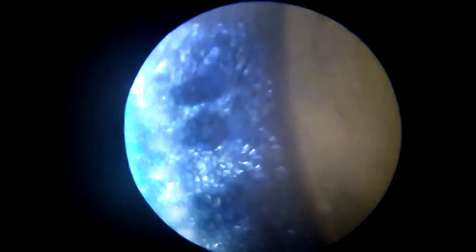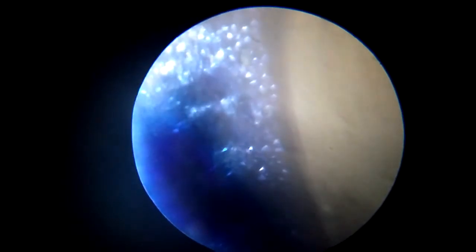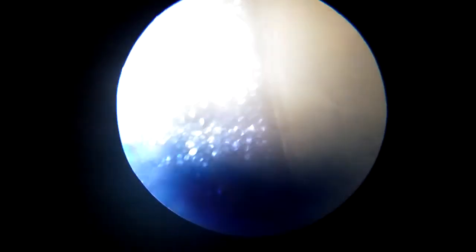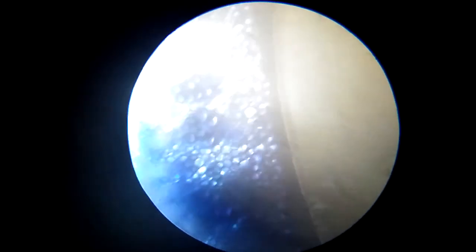The observation is very good under the microscope, though due to different focusing we have some problems. Let's look at these tissues and the arrangement of tissues in the leaf stalk of Carica papaya. The xylem and phloem are arranged in a ring manner because the entire leaf stalk is hollow from the inner side, and only the ring-like structure can be seen.